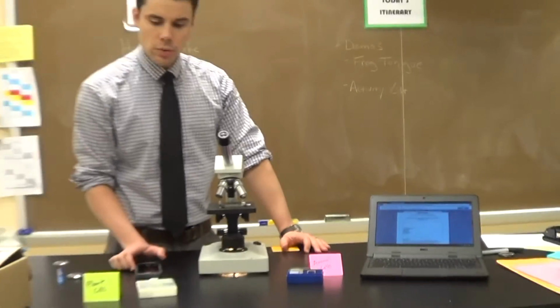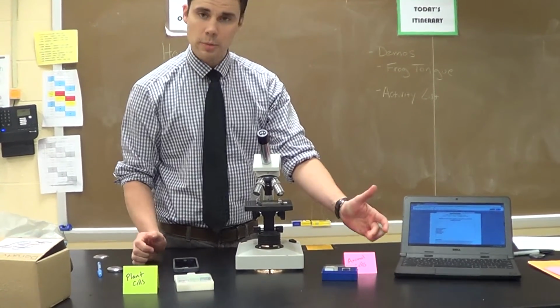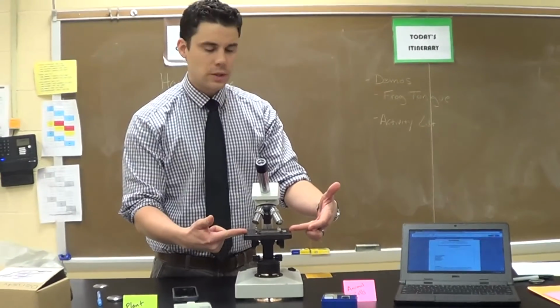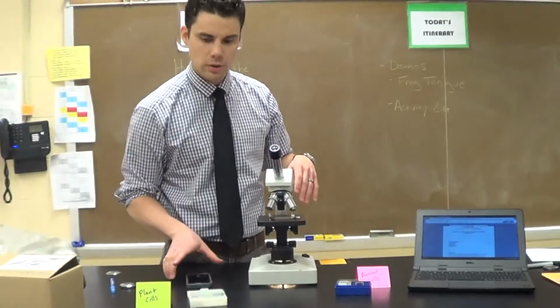So what students are going to do is they need to gather and look for patterns in several plant cells, and gather and look for patterns in several animal cells, using the observations that they make through their light microscope. All of these observations, all these pieces of data are uploaded into the Google document, so it's all digital.